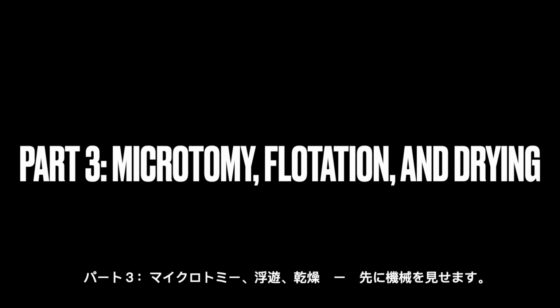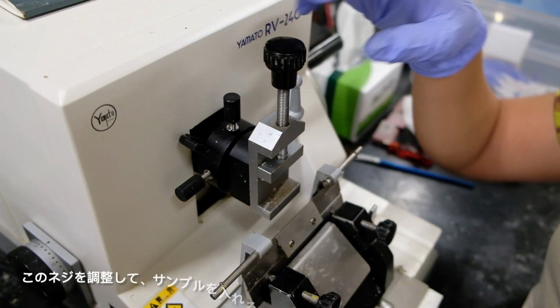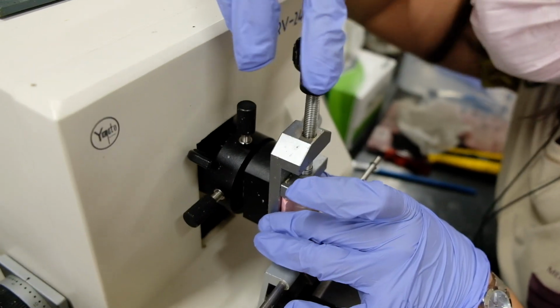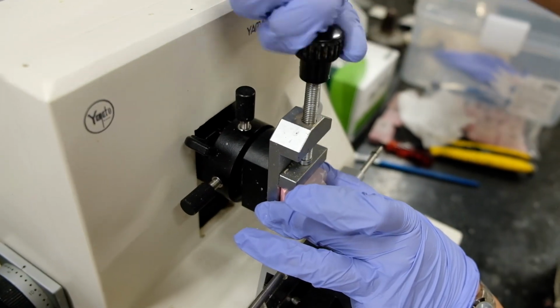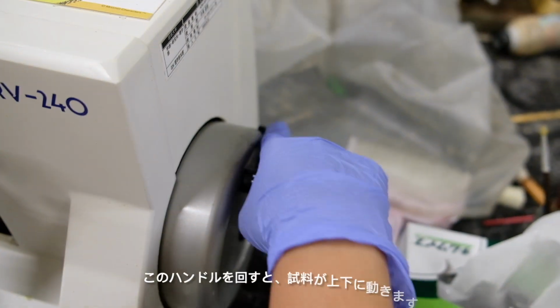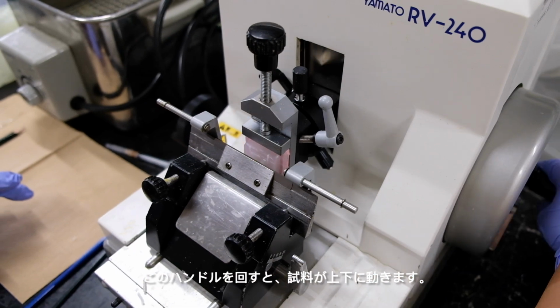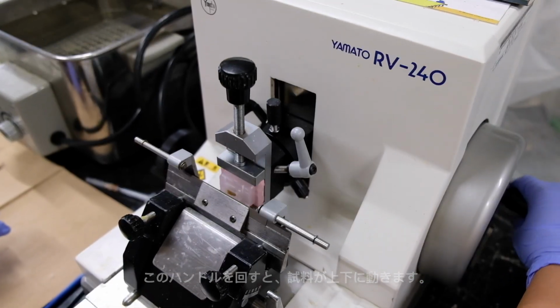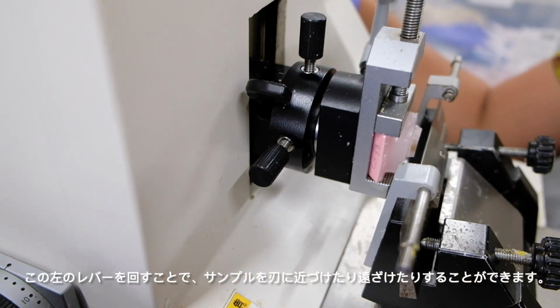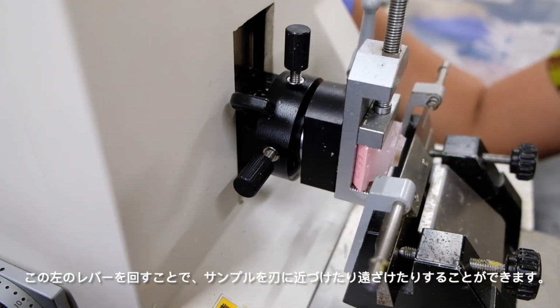We'll then move on to this next part and first show you the microtome. First, we can adjust this screw to put the sample we just made in it. By turning the handle on the right, it moves the sample up and down. By adjusting the small lever on the left, it brings the sample closer to or farther away from the blade.